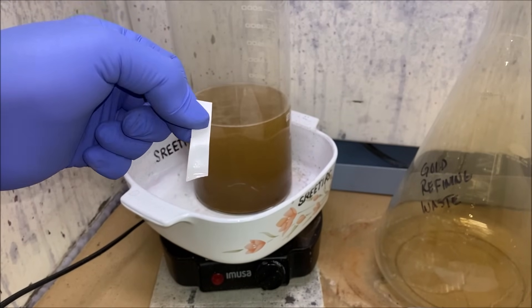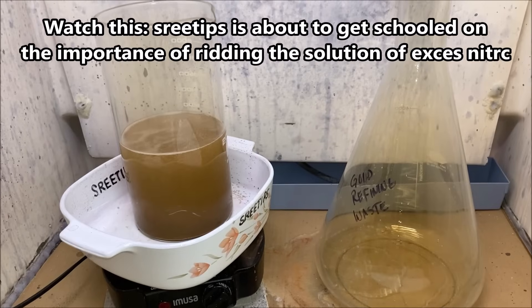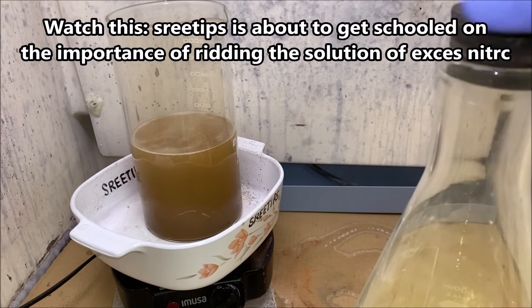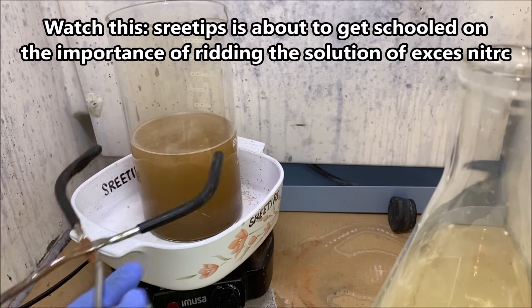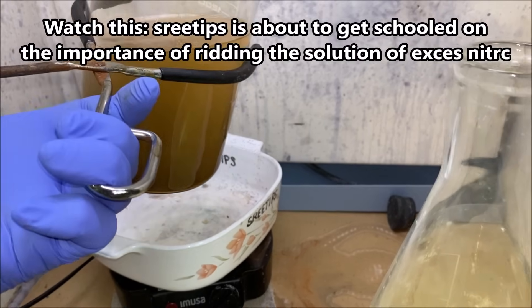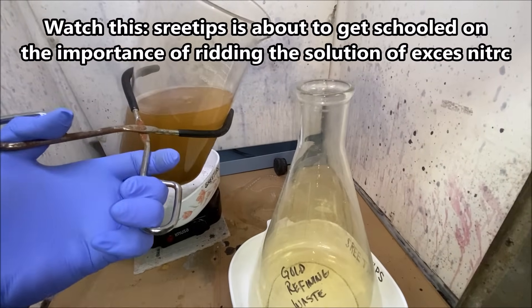I don't see any reactions. I'm seeing some fumes being produced here. After that last boil-over I had, I'm not going to take any chances — I'm going to get this off the heat and pour this solution off into our waste container before I have another catastrophe.